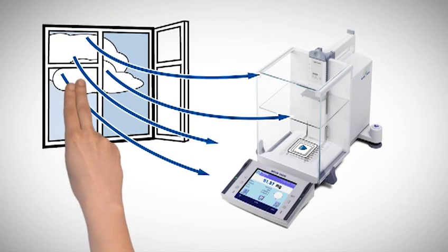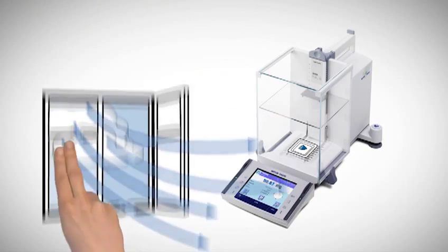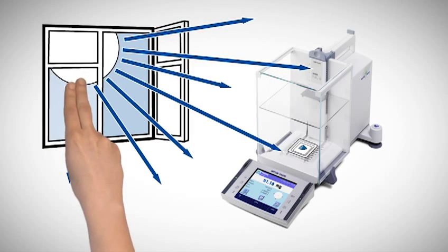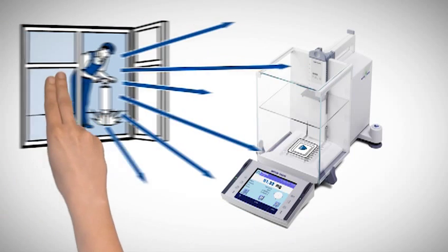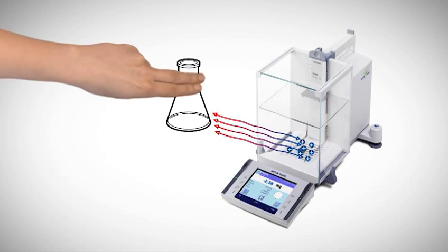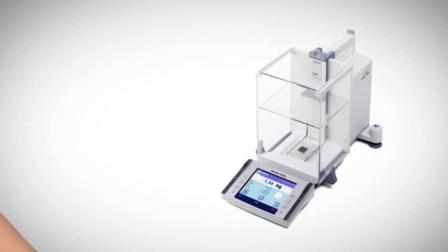USP 1251 provides practical recommendations for the qualification and operation of balances. Among others, it describes several environmental factors that can influence the performance of a balance — for example, air currents, temperature variations, vibrations, electrostatics, and many more.